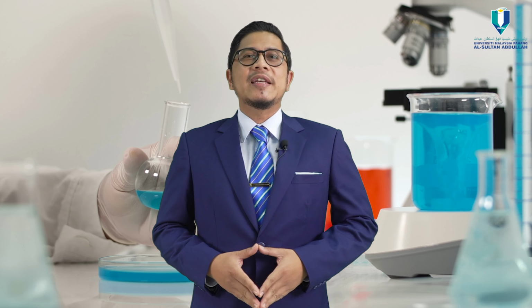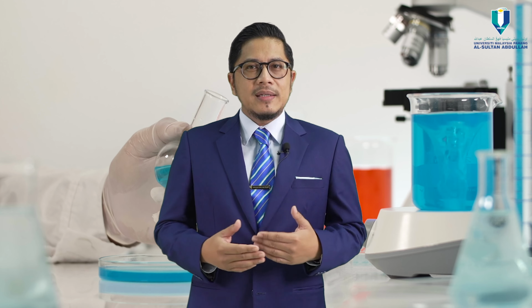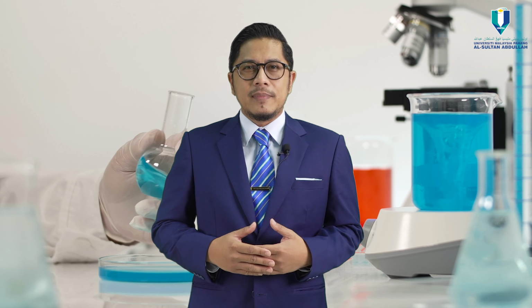Good day, students. Today we'll delve into the world of X-ray diffractometry, a powerful technique widely used in material science, crystallography, and various other fields. In this lecture, we will explore the theory behind X-ray diffractometers, understand how to load samples effectively, and dive into result analysis. Let us start with the theory.